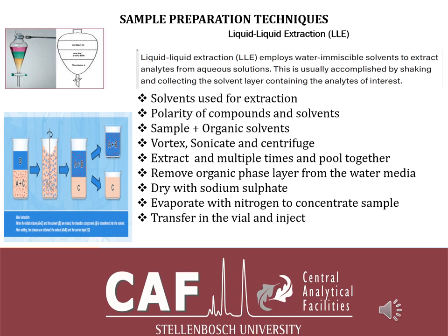Liquid-liquid extraction: some of you who've done chemistry from level 1 until you finished will remember when we were just starting, we were doing extractions where we were shaking, and we were doing it just because we were fascinated. We didn't really know what we were doing and how important that is. If you look at the top left corner, you'll see there's a separating funnel and some colors. I guess it brings up some memories, without giving away your age, of course.